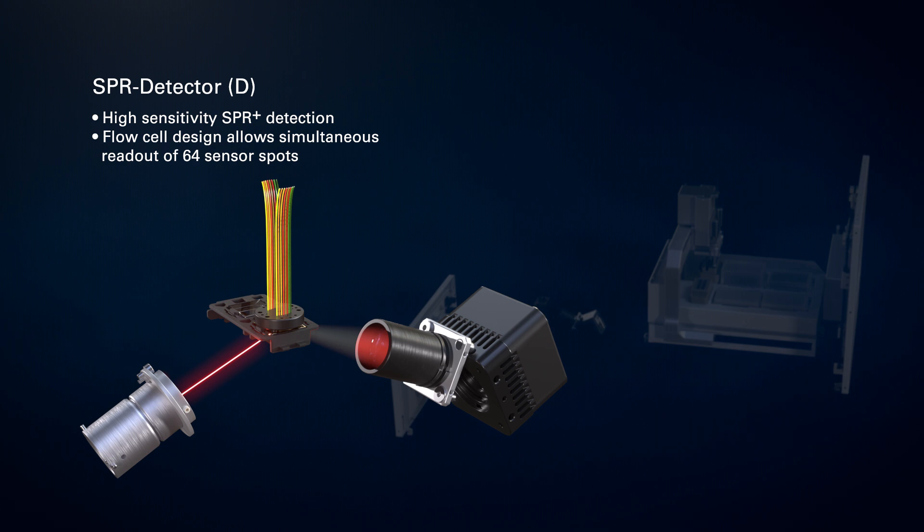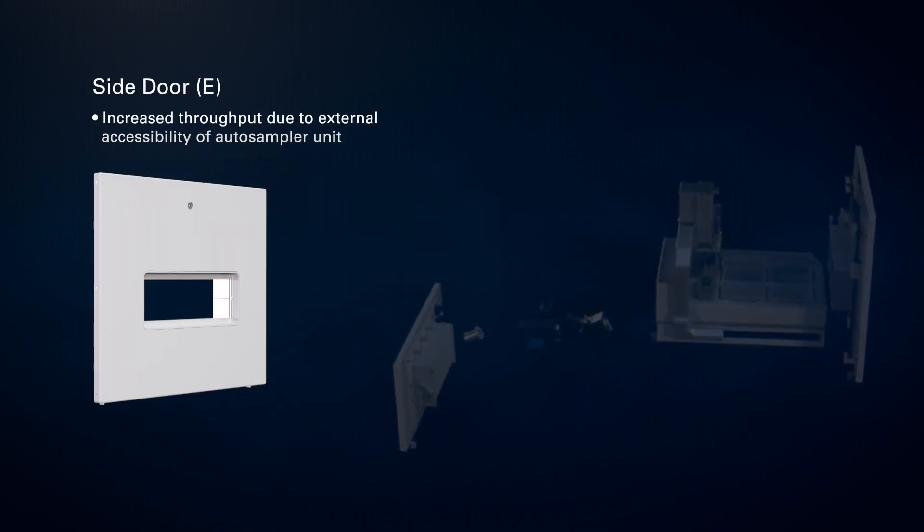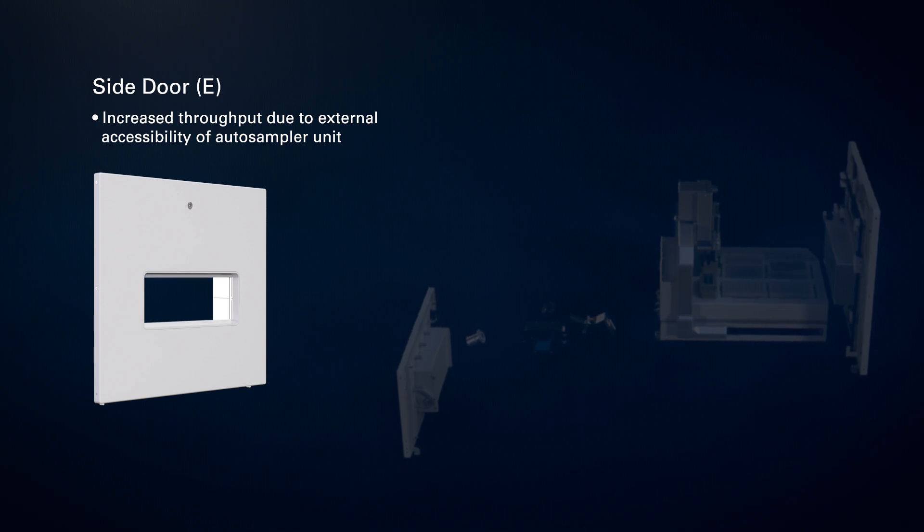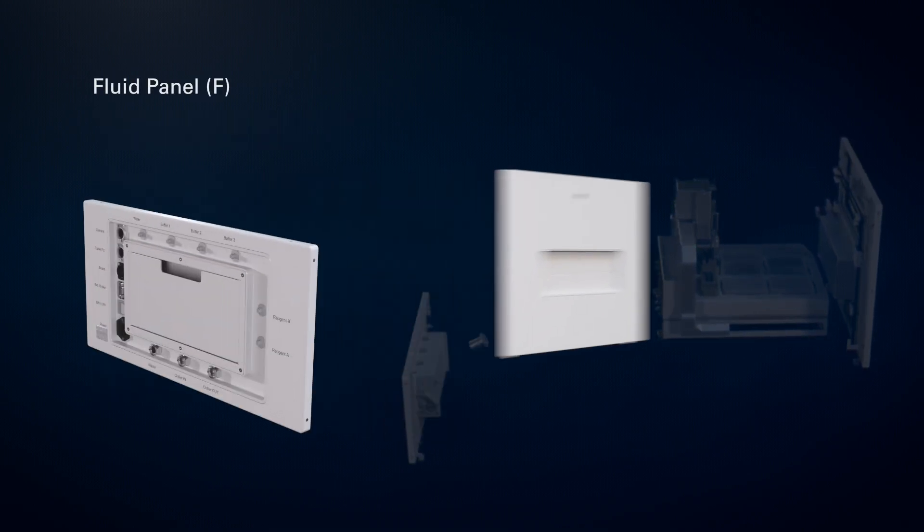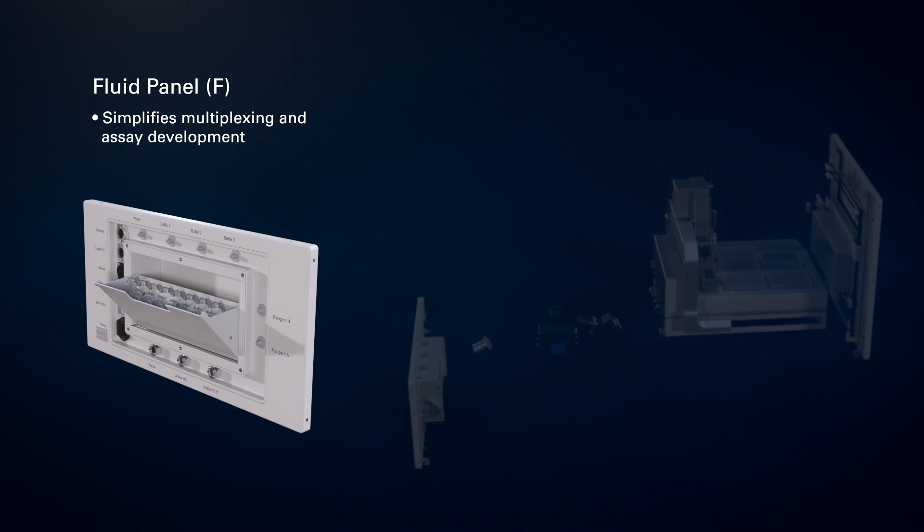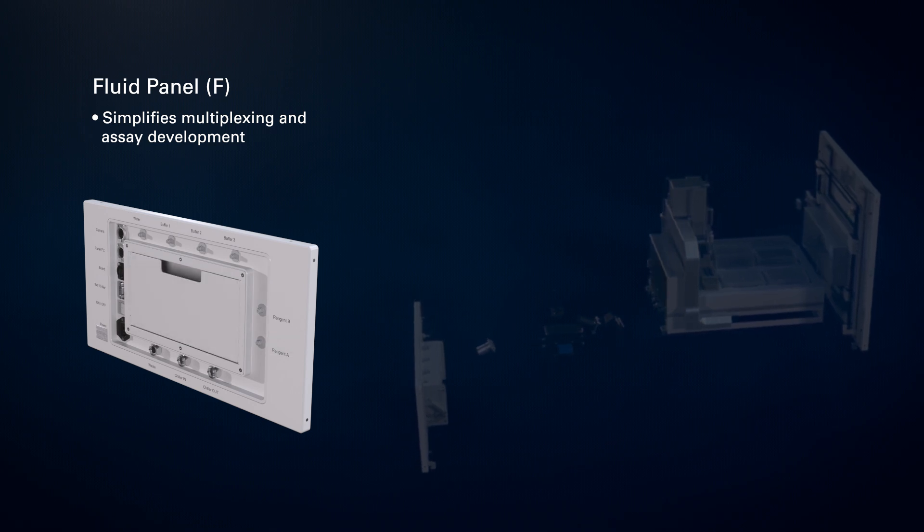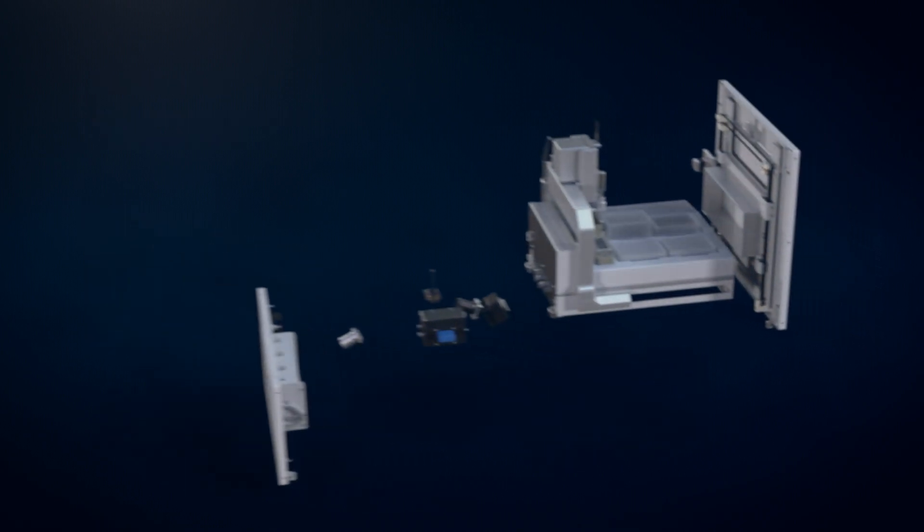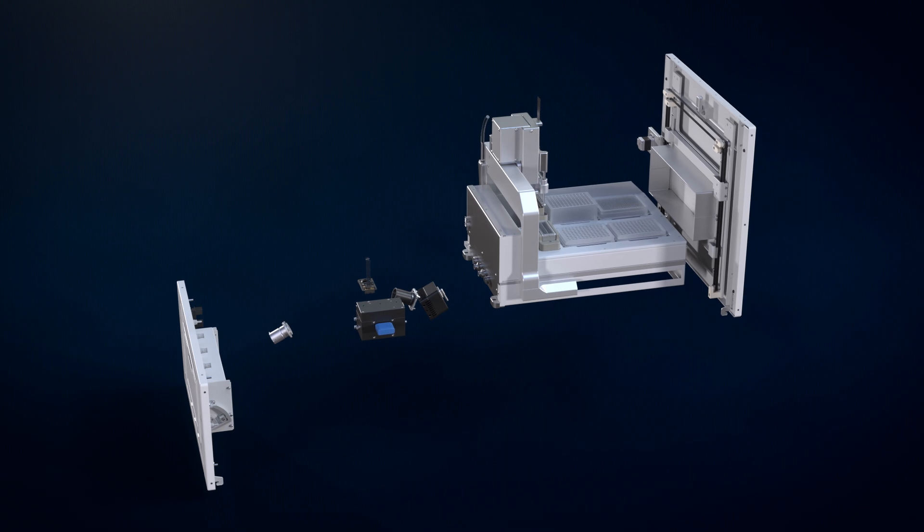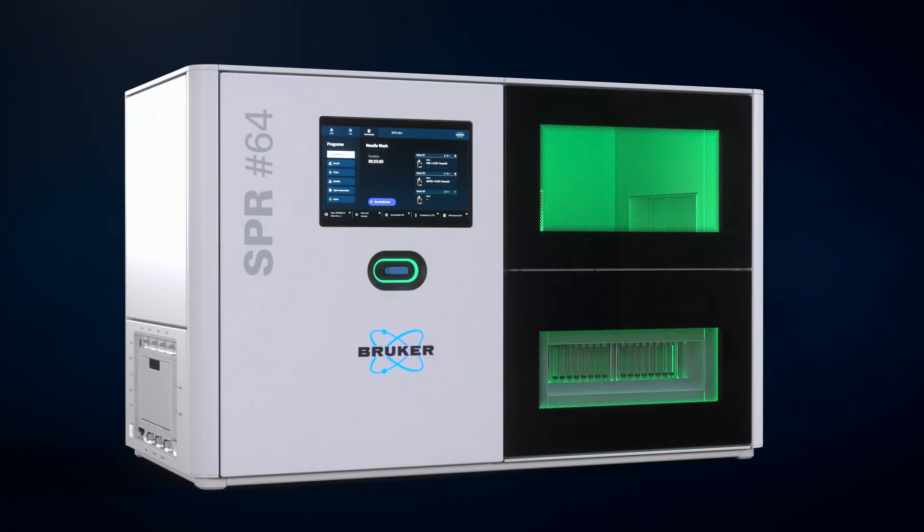The SPR-64 finally combines everything you need to do high-throughput SPR-based research. You have the science to do it, and Bruker supplies the tools. Be ahead of your time. Use the SPR-64.